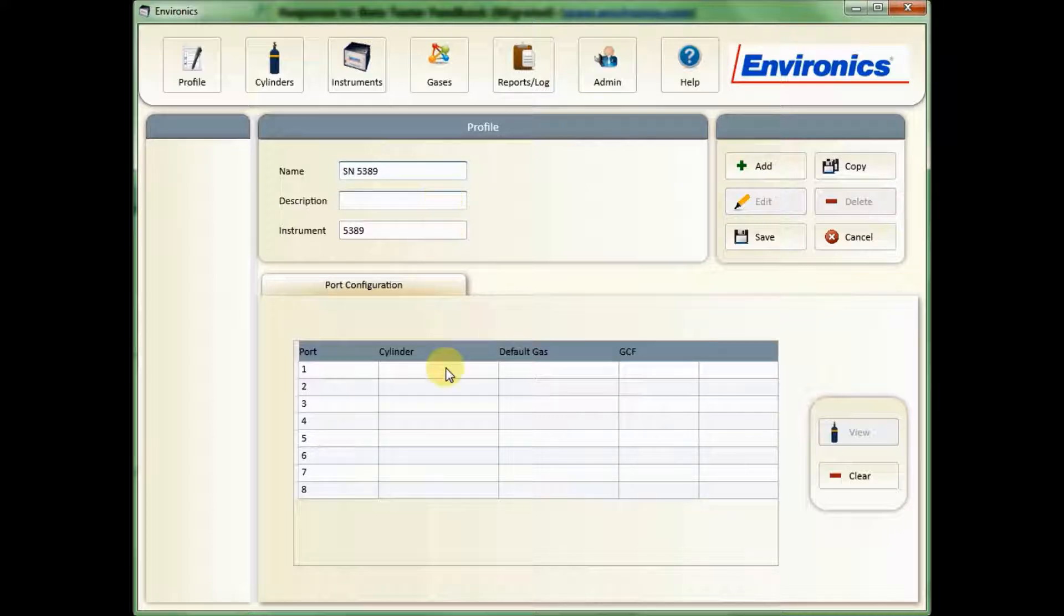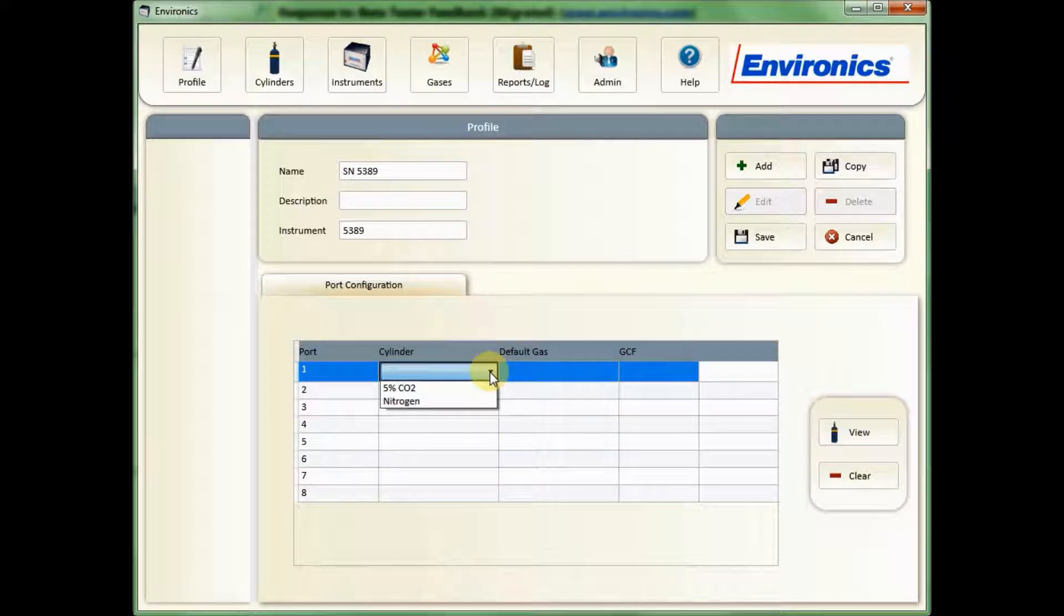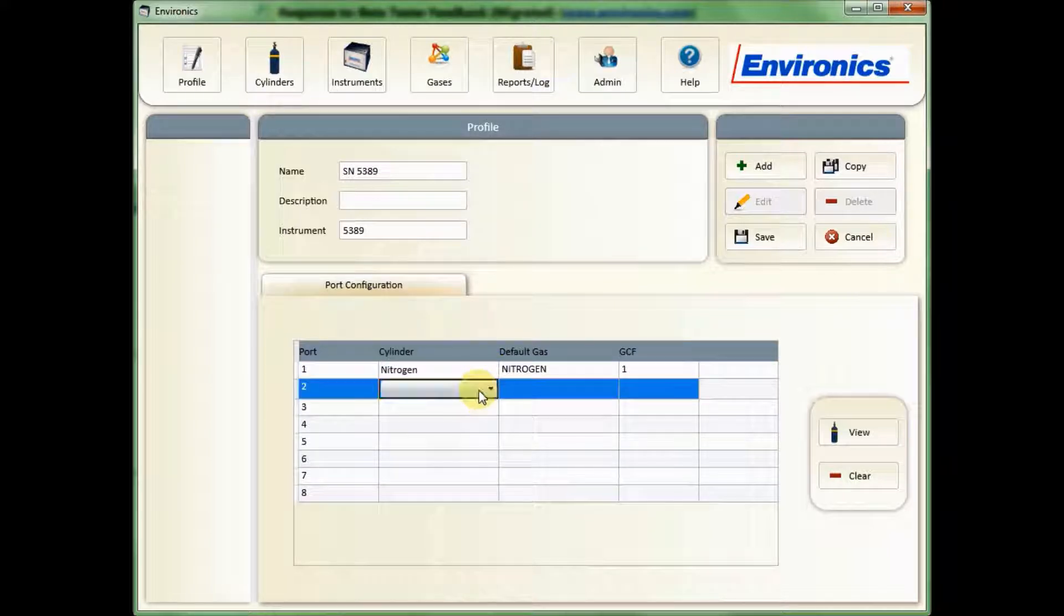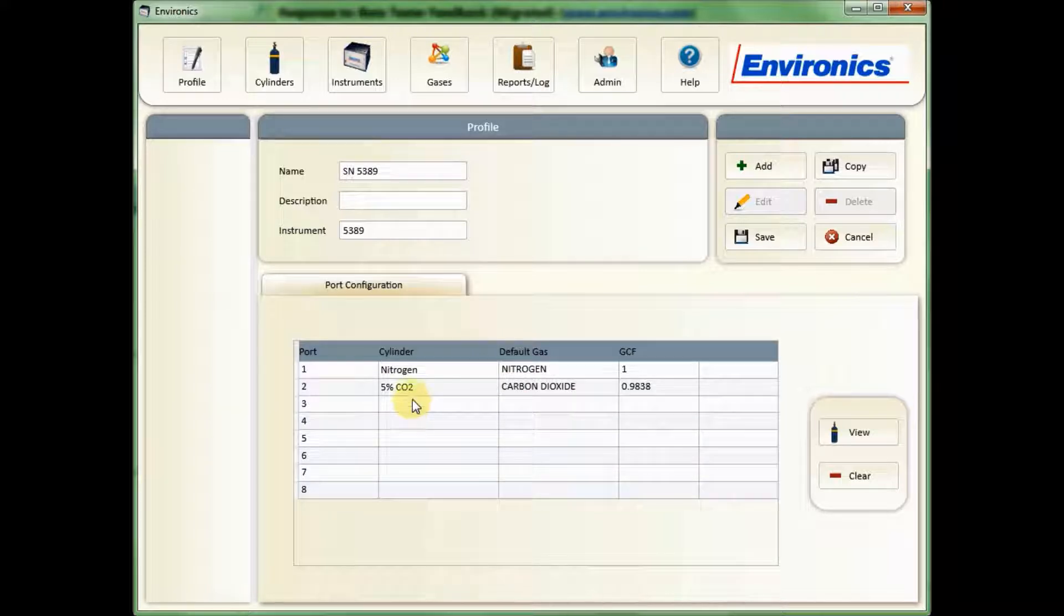You're then going to go to this graph on the bottom, double click on Cylinder, Port 1, and assign a cylinder. I'll have my nitrogen on Port 1, and double click on 2, and I'll attach my CO2 cylinder here. If you have multiple cylinders, you can attach them wherever you'd like.